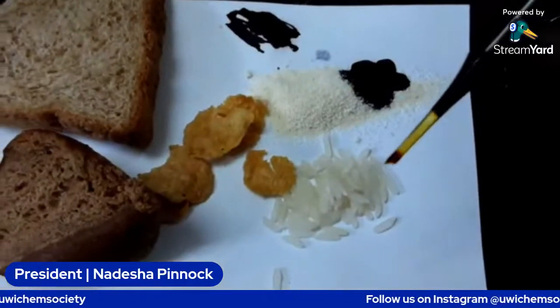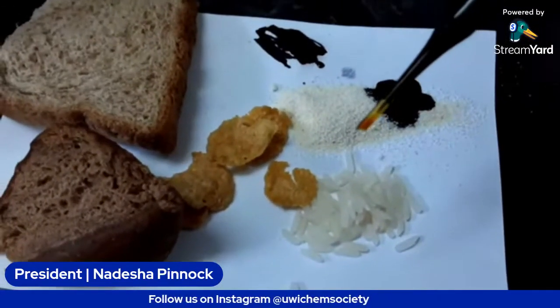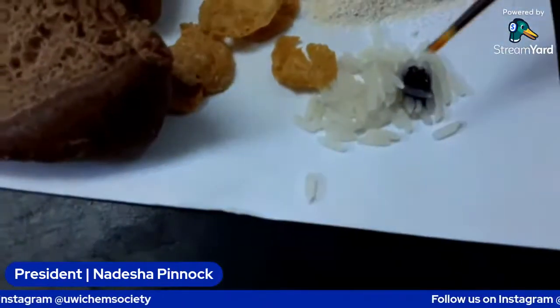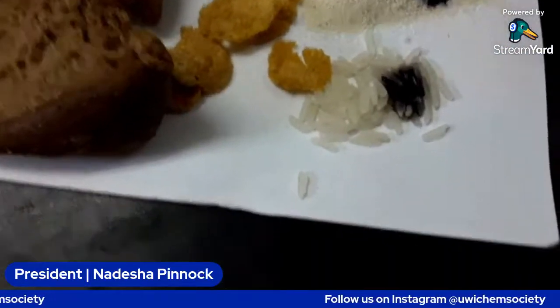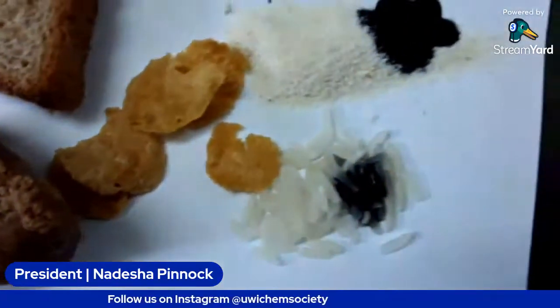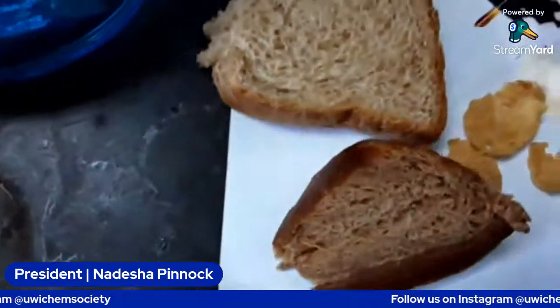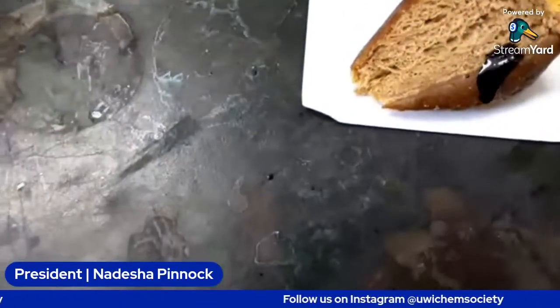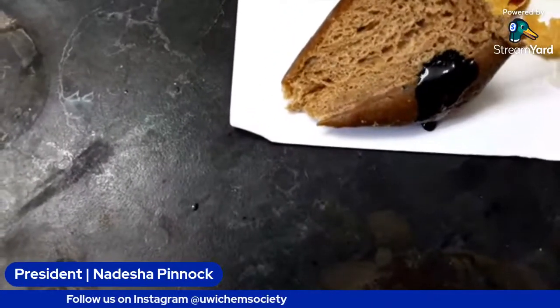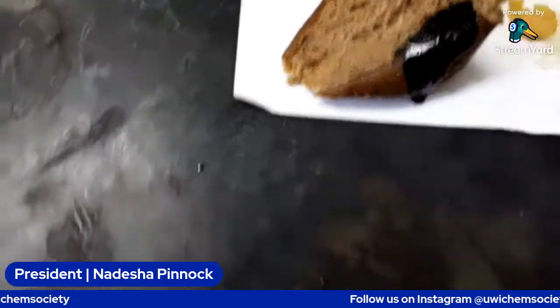So we know that the iodine has a brownish yellow kind of color, right? As you can see in the dropper. When we add it to something that has starch, it no longer has that color. It has this dark blue-black color, as we said. Right? So we're going to add it to the bun. So we're seeing the blue-black color on the bun. My good bun.